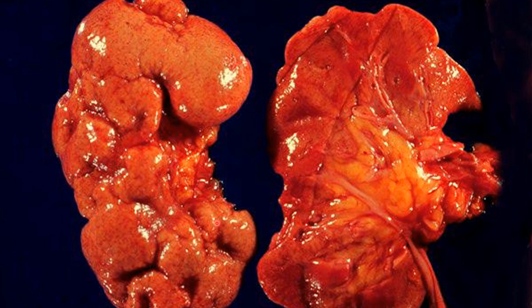Okay, and most importantly, because of the healing process and scarring, you can see there's scarring of the cortical surface of the kidney. And when we cut the kidney, you can see that there's a reduction in the thickness of the cortex layer. Okay.